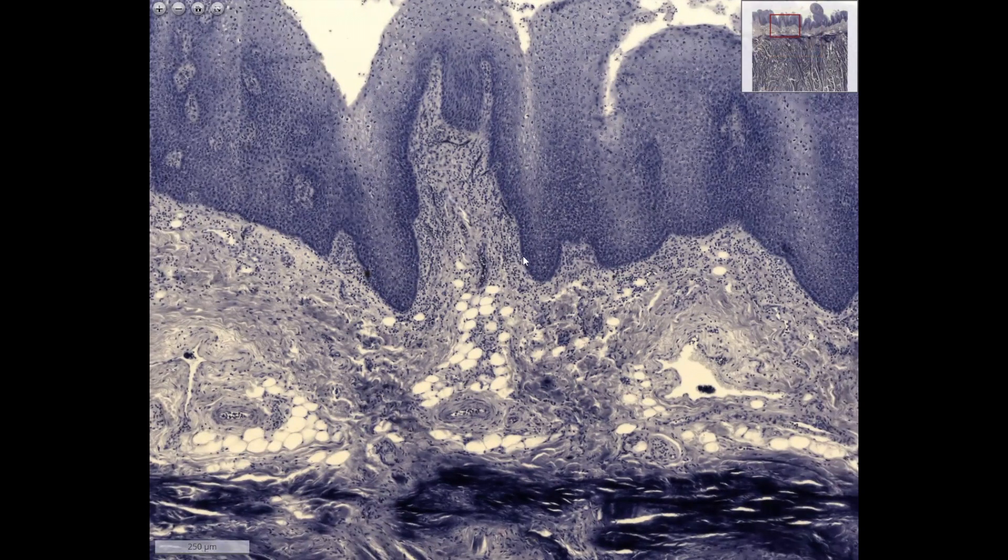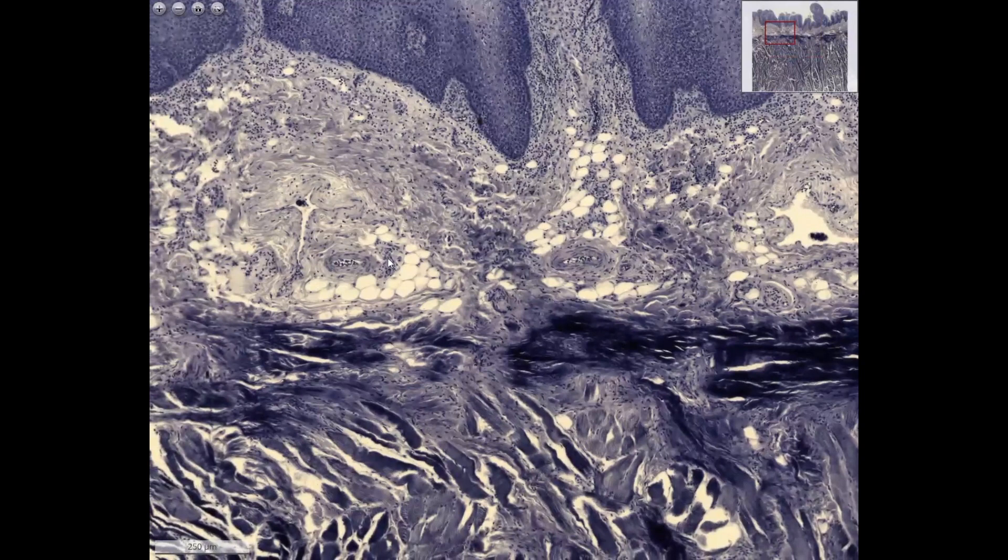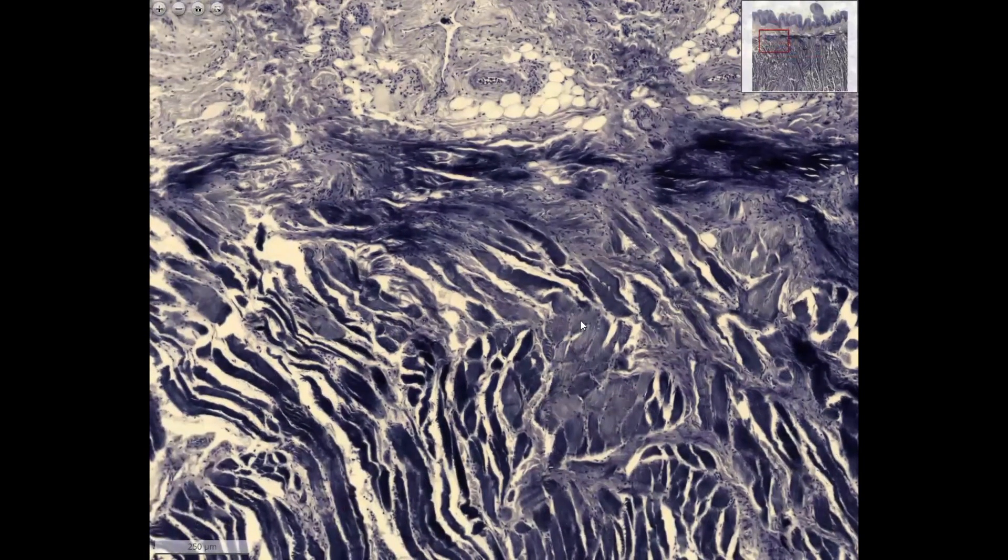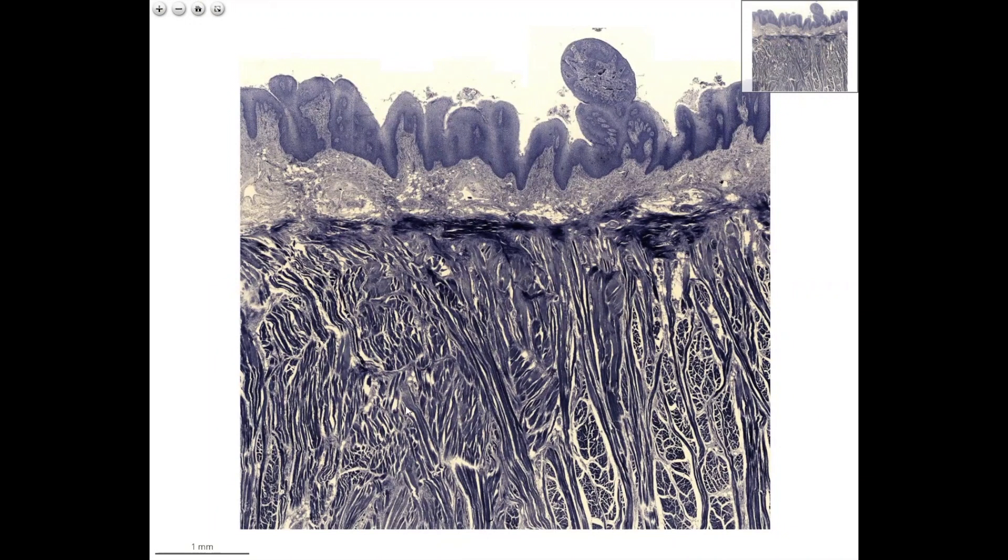Underneath, this is a loose connective tissue, a cell-rich loose connective tissue with many lymphocytes. Deeper, fat cells also appear. And underneath, here you have the skeletal muscle fibers in another specimen, where you don't have salivary glands between the muscle fibers.